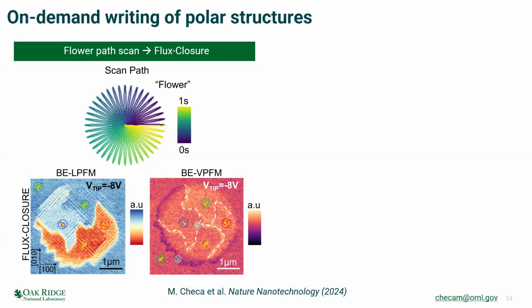The key point here is the expertise on controlling this. I didn't show any of that, but all the FPGA work and the microscopy was developed for a scanning transmission electron microscope, to move the electron beam. And then we just adapted it to an AFM. But there's a lot of work done in Oak Ridge where they move the electron beam in certain directions to, like, get an atom out of the lattice or something.